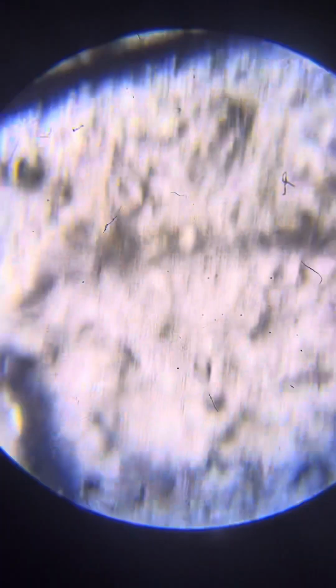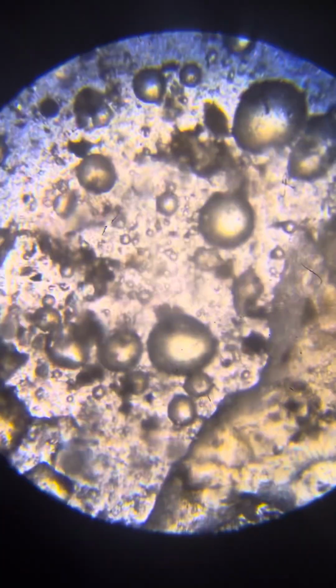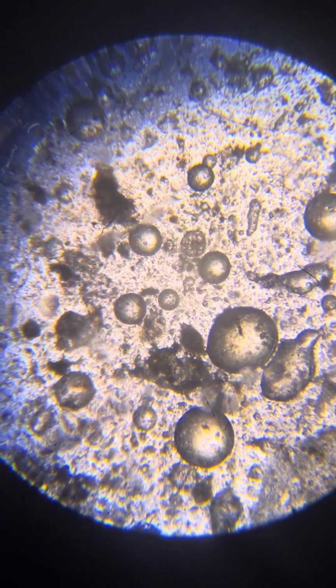The frequency of the neos and the size pretty much kept the same. Sometimes you see more density of neos, but we didn't see very big ones, we've seen many of medium size, I would say. We didn't see huge ones, but it's okay. Give them some time to grow.